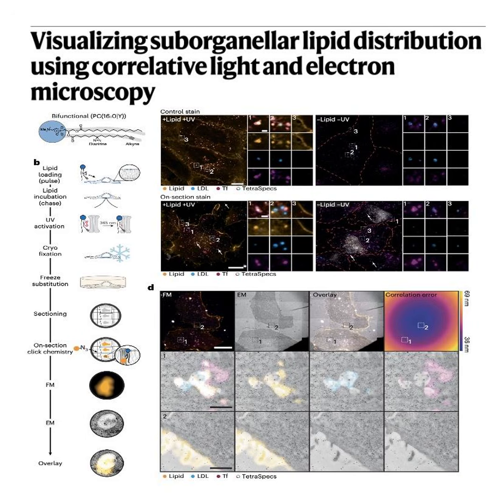They snap together like molecular Lego blocks. And the paper notes they actually stain it twice to aggressively boost the signal-to-noise ratio. They do. And finally, to perfectly overlap the wide-field fluorescence images with the incredibly high-resolution transmission electron microscopy images, the TEM images, they map them using multicolor fiducials called tetraspecs. Tetraspecs, that gives them perfect spatial overlap. Okay, let's pull all of that together for our next rapid-fire recap. Go for it.